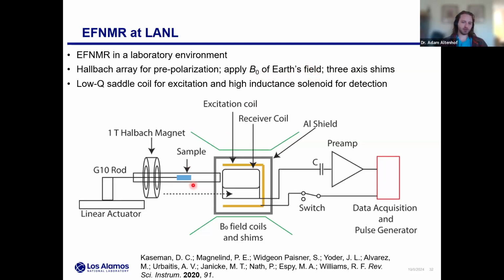So how this experiment works for us: we take a sample, which is quite nice. It's just a standard 5 millimeter NMR tube. The only special thing is we tend to degas it, get rid of paramagnetic oxygen to keep the line width sharp. We load this in this G10 rod, this fiber rod, that's being held by this motor, this linear actuator. And this is going to be very rapidly shuttled to this 1 Tesla magnet for prepolarization. Earth's field, 50 microtesla, is going to give you very poor thermal polarization, so it's basically necessary to prepolarize. The motor rapidly shuttles it into this detection area where, again, we have our Helmholtz coil with B naught at Earth's field.